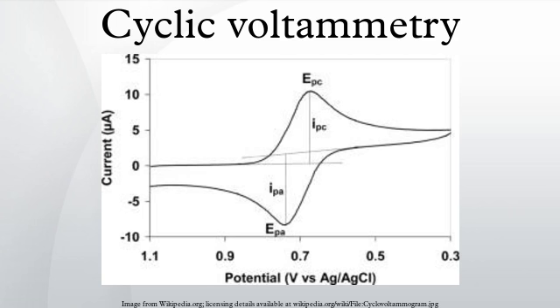In addition, because concentration is proportional to current in a reversible, Nernstian system, the concentration of an unknown solution can be determined by generating a calibration curve of current versus concentration. In cellular biology, it is used to measure the concentrations in living cells. In organometallic chemistry, it is used to evaluate redox mechanisms.